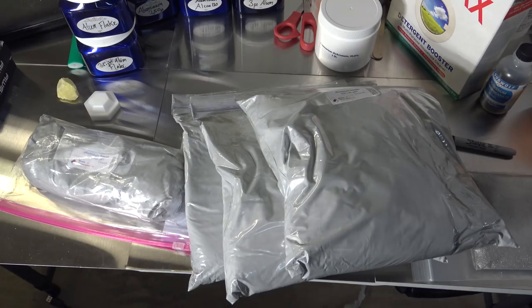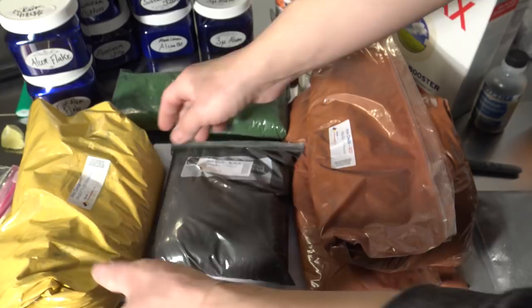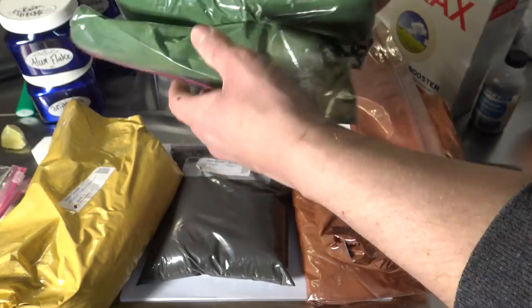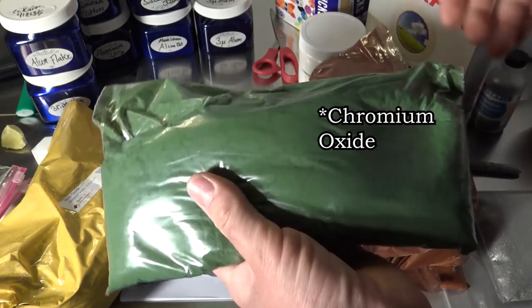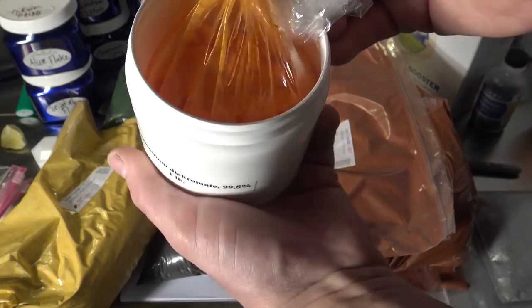So the first thing on our list is to get the metal oxide that you want to extract the metal from. It's something to note that there are usually many different oxides available of the same element, each potentially more or less reactive than the other. While they're not all as dramatic in reactivity difference like with red and black copper oxide, many are not as easy to tell apart as they are. Compounding that is the fact that because many of these oxides are used as ceramic pigments, many suppliers are not well versed in knowing exactly what it is they have. As far as purity of the oxide is concerned, there's really no need to pay the extra money to get the really pure stuff. 97% is more than sufficient.